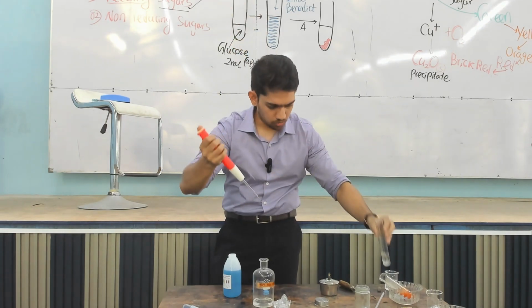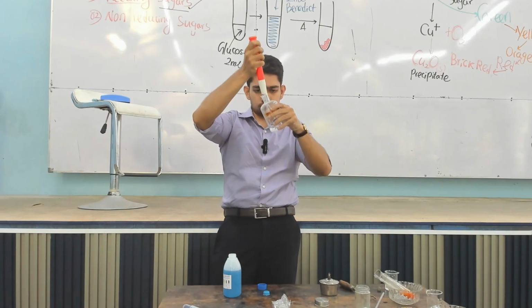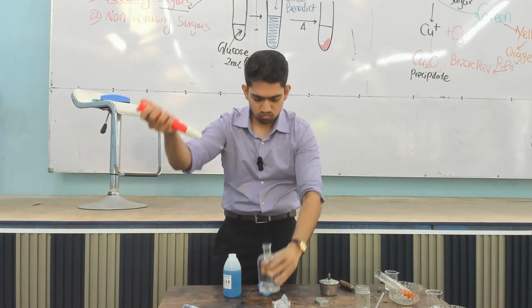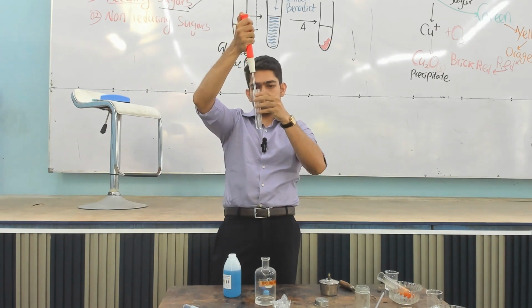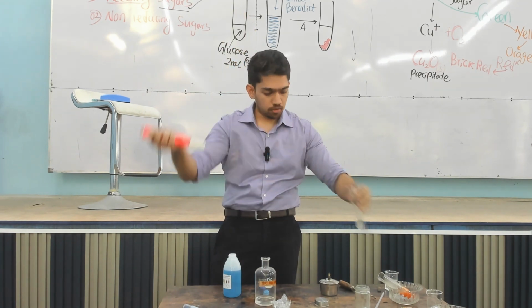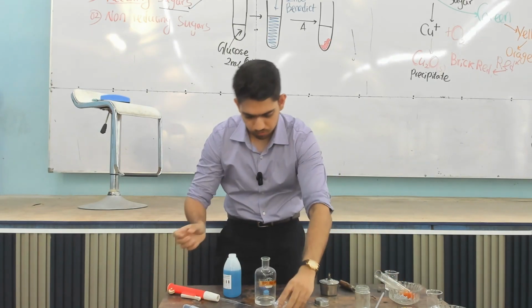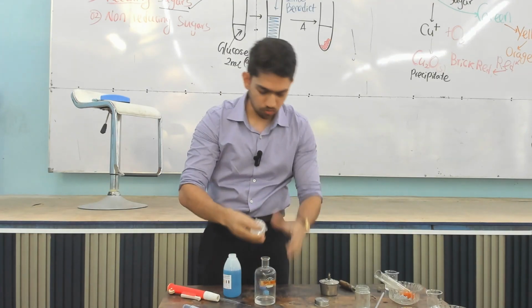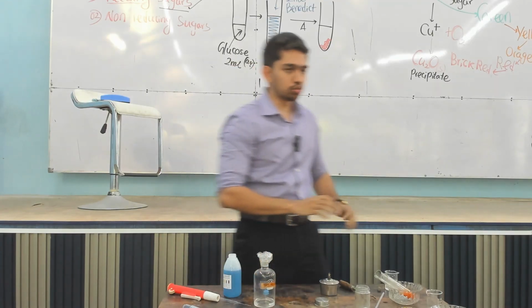Let's add a little bit more, right? Let's add a little bit more. Okay, right. So we have added the acid. Then what do you need to have? You need someone to neutralize this.